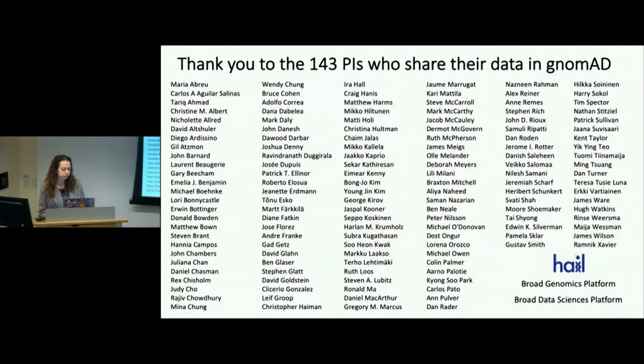So it only exists because of 143 PIs who agree to share their data into the data set. Most of this data is actually sequenced at the Broad and at the genomics platform here. And then we've really relied heavily on close collaborations with the Broad Data Sciences platform and the Hail team, as being able to aggregate and call this much data together in one unified call set has required a lot of innovation in the algorithms.